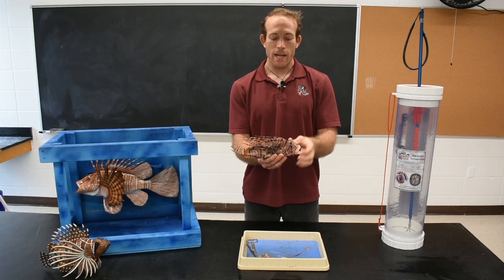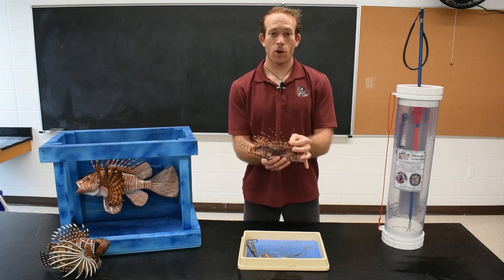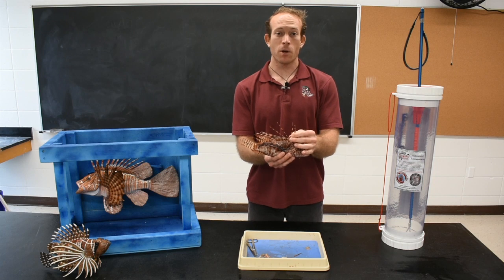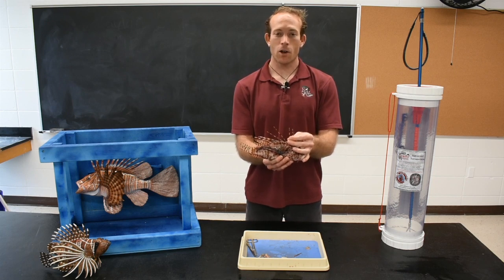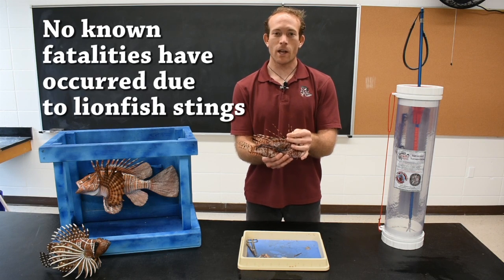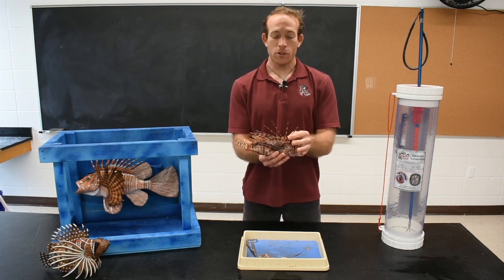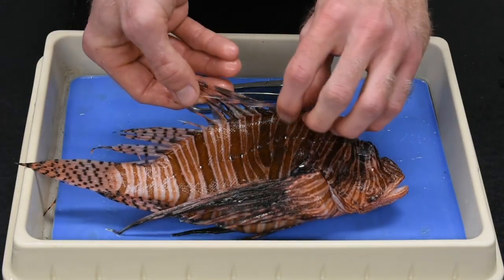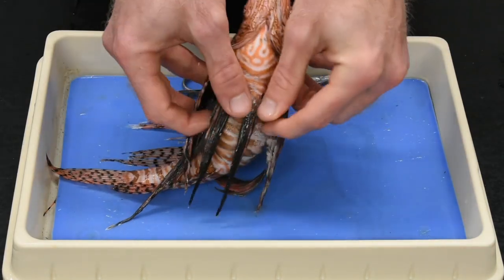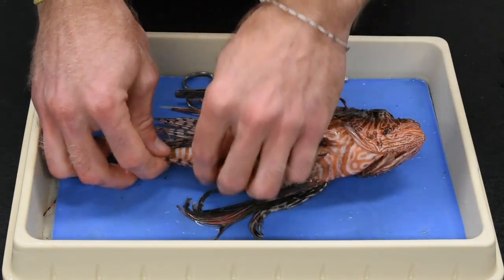The first thing I will show you are the 18 venomous spines on the lionfish. These spines are not hollow — they are hard structures with grooves on each side that are filled with a glandular tissue housing a potent neurotoxin. The neurotoxin can cause pain, tingling, numbness, and even temporary paralysis. The best treatment for a lionfish sting is a heat pack or hot water, which helps break down the protein in the neurotoxin. There are 18 venomous spines total: 13 on the dorsal fin, one on the front of each pelvic fin, and three at the front of the anal fin.